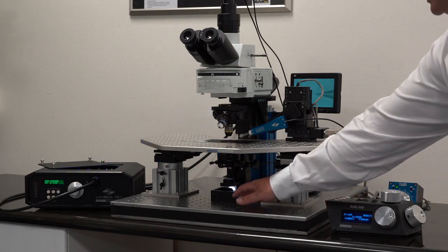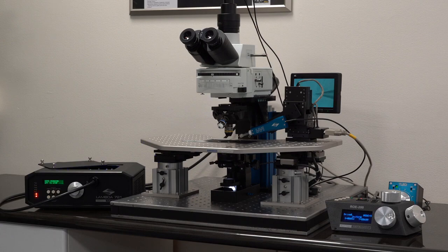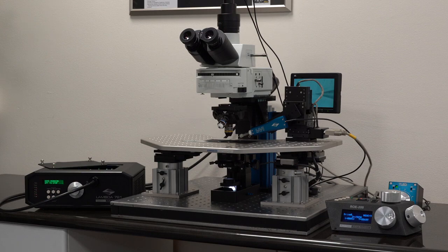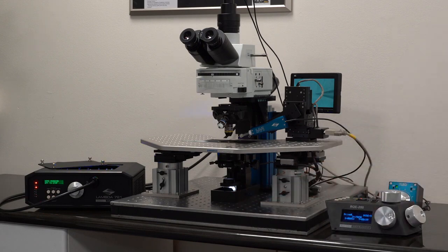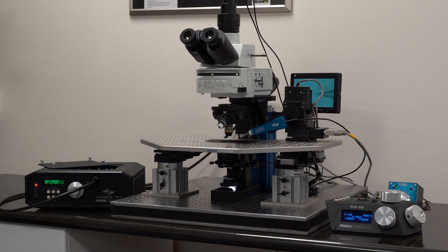Specifically the transmitted light system has both a white light and IR LED at 940 nanometers. The 940 nanometer LED is used for IR DIC. This entire transmitted light system can be easily removed when switching between in vivo and slice.